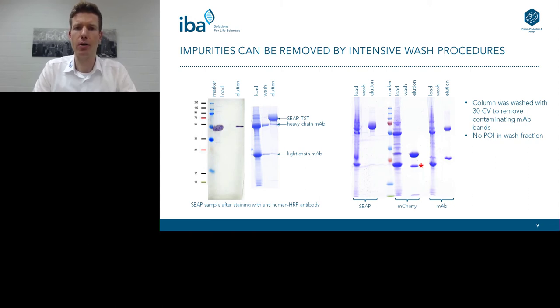However, it gave us a great opportunity to challenge our system, because we wanted to see how we can deal with even these challenging purifications where we might have highly concentrated contaminations. We made use of a benefit of the system, because the Twin-Strep-tag Strep-Tactin XT system has a binding affinity in a picomolar range. This is the highest binding affinity available among all commercially available tag systems on the market. But as it relies on avidity, as I've shown before, it's still reversible.